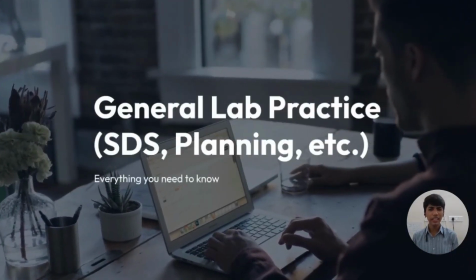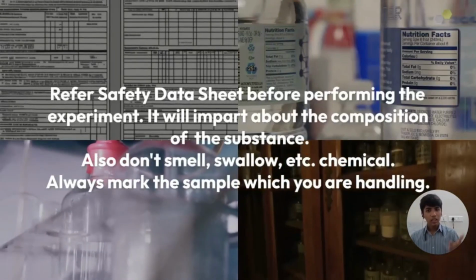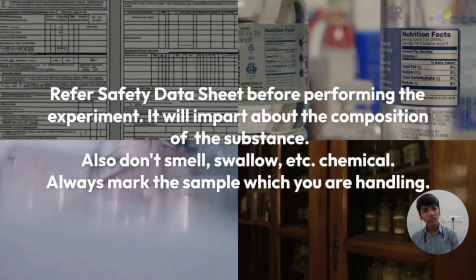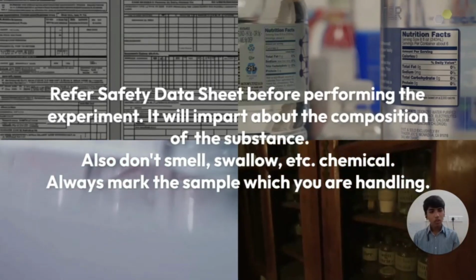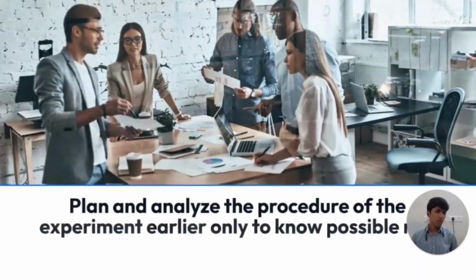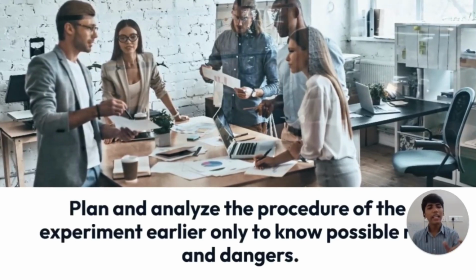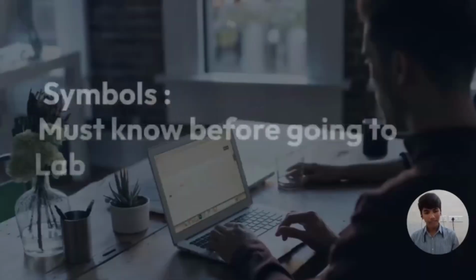Now you should maintain general lab practice. Before doing any experiment, refer to the SDS, the safety data sheet. Read the contents of the reagent and make a draft of the procedure of what you are going to do in the experiment. This will help in knowing the possible risks and dangers of the experiment, so you can analyze that early to safeguard your own and others' lives.